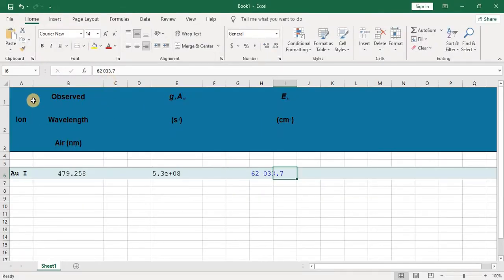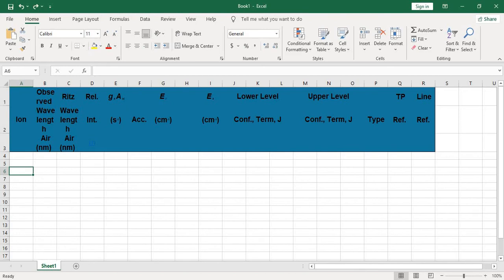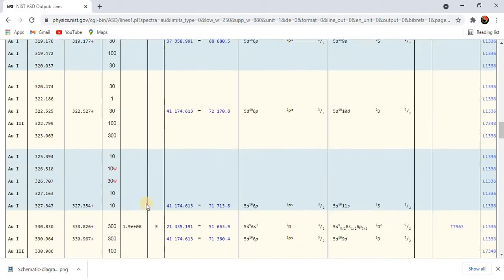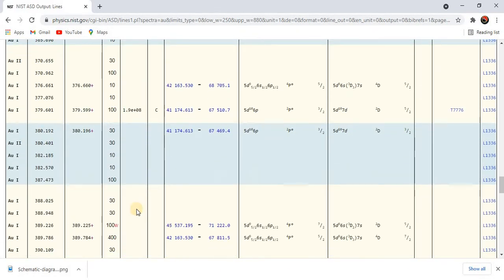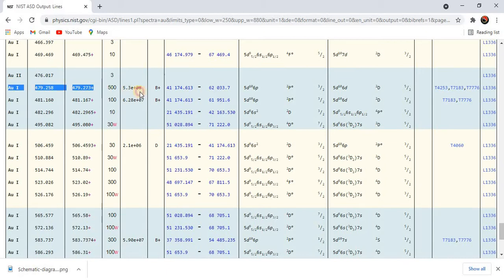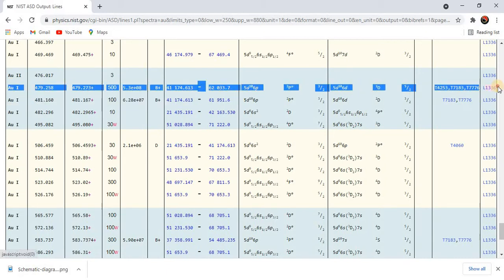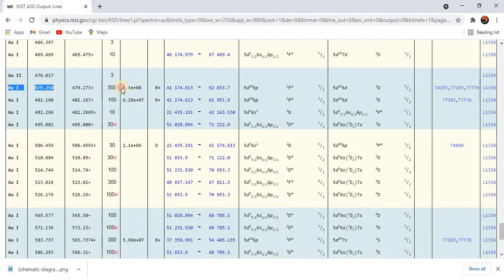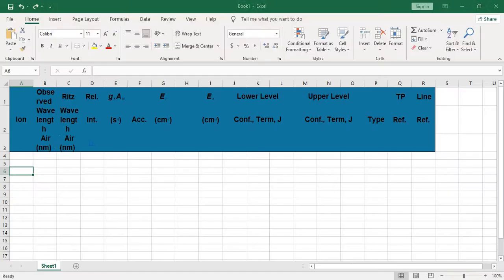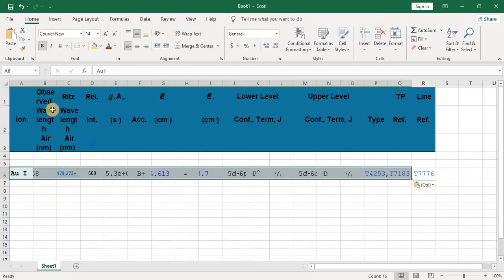First, select this row and paste it in the Excel sheet — I have already done this. Next, select the particular line you want. For example, my first line is 479, so I will select the 479 line and copy all the related data, then paste it into the Excel sheet.